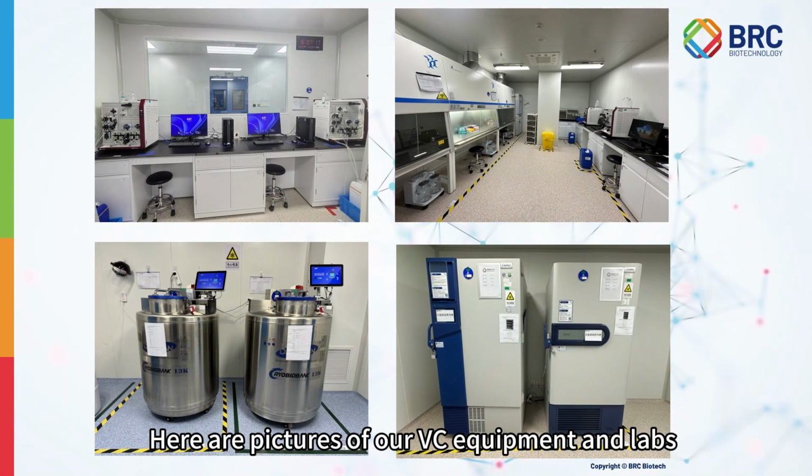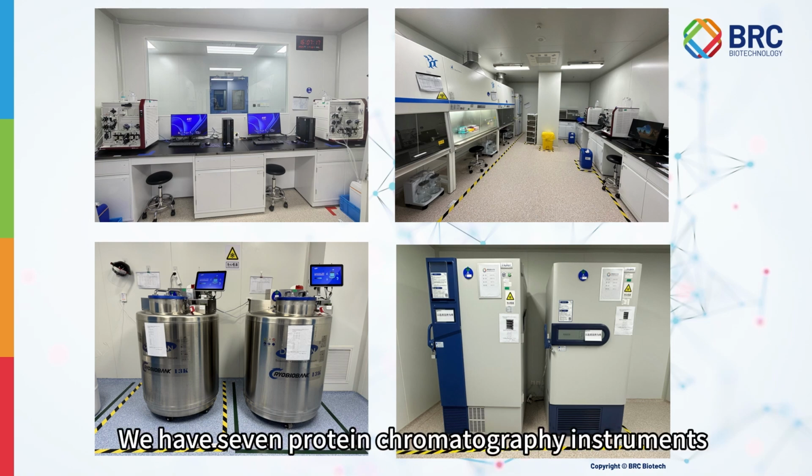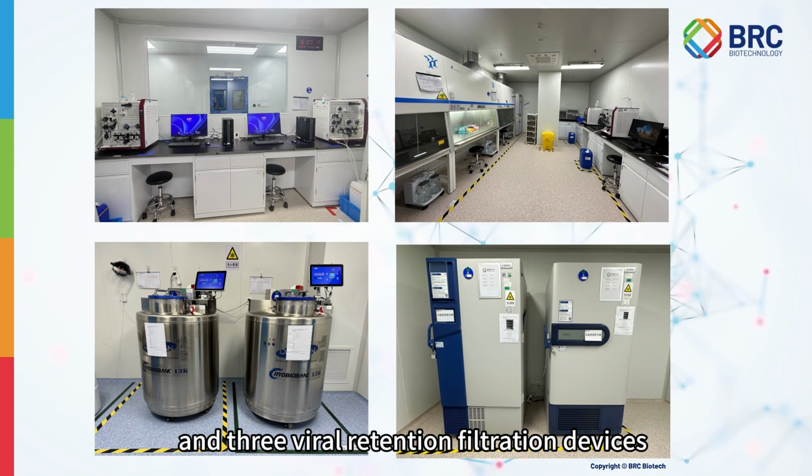Here are pictures of our VC equipment and labs. We have 7 protein chromatography instruments and 3 viral retention filtration devices.